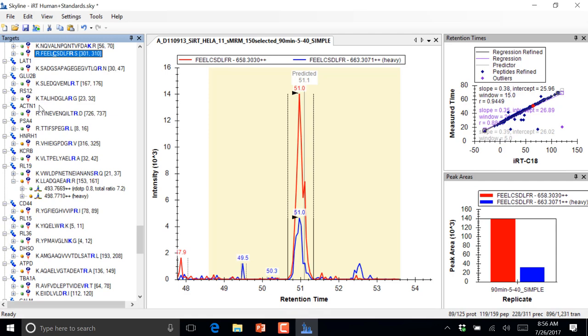Yes? If you had those two 30-minute replicas and your IRT standard and you're also picking the peaks, how would you actually specify the actual retention time of the peaks to use, or specify their location in the 30-minute gradient, 90-minute gradient? Didn't catch that one.